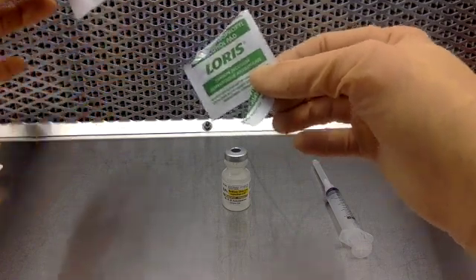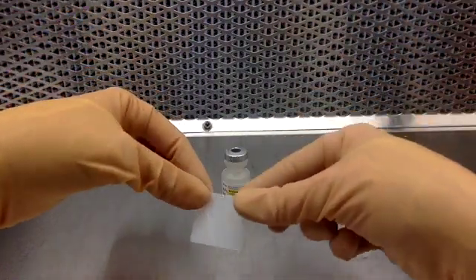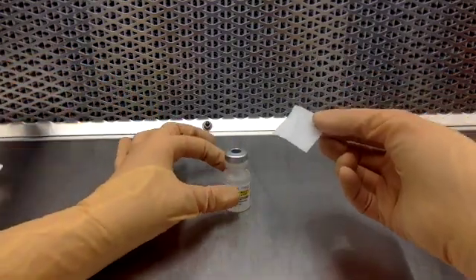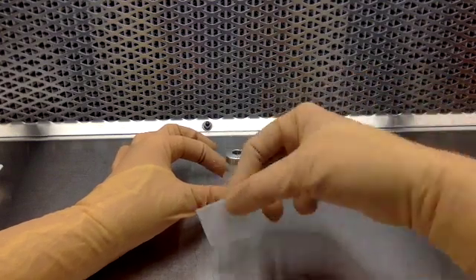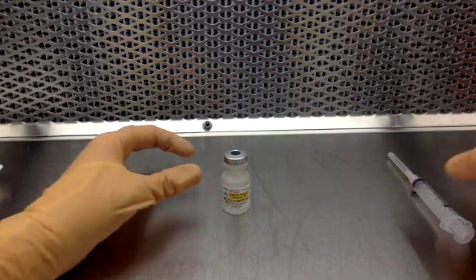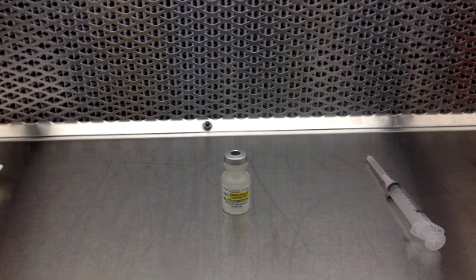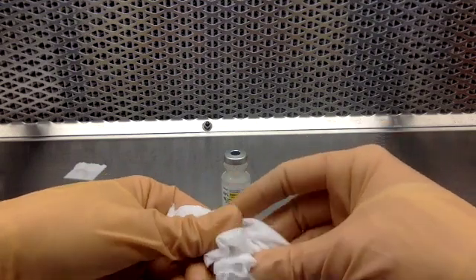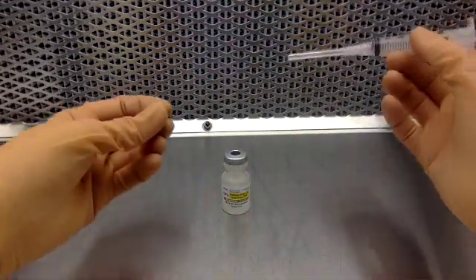Before you can enter in through the rubber septum, you must disinfect the rubber septum. If you are in a horizontal hood, that means you are supporting the vial with your less dominant hand and firmly wiping 3 times in the direction of the airflow. You have to allow that to dry, which is typically around 10 seconds. If you ever touch a dust wrapper, you have to make sure that you wipe your fingers off.